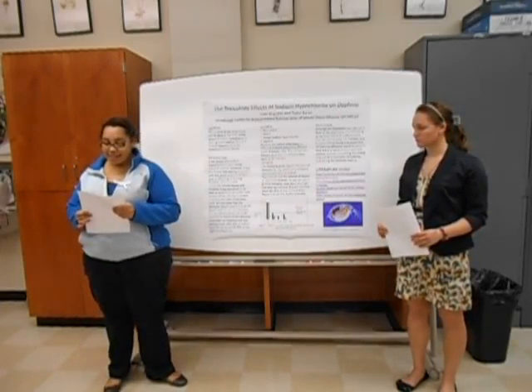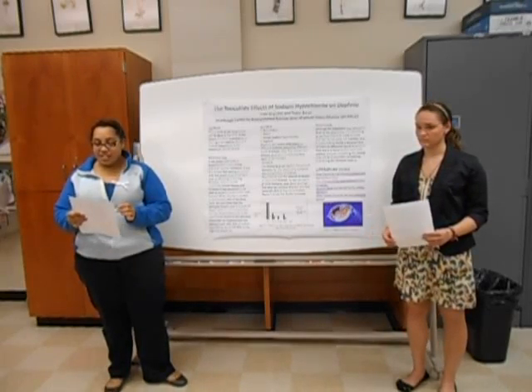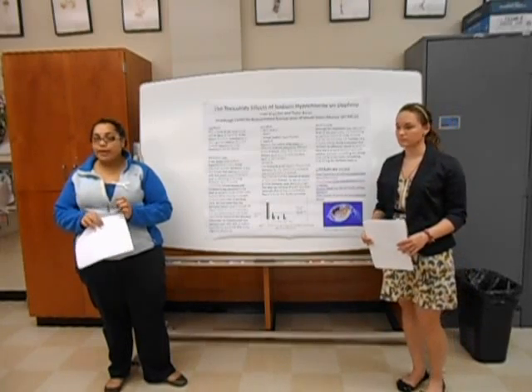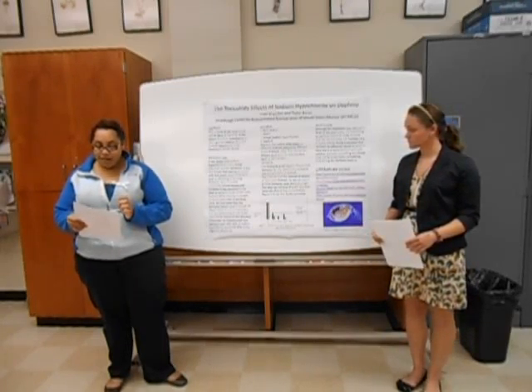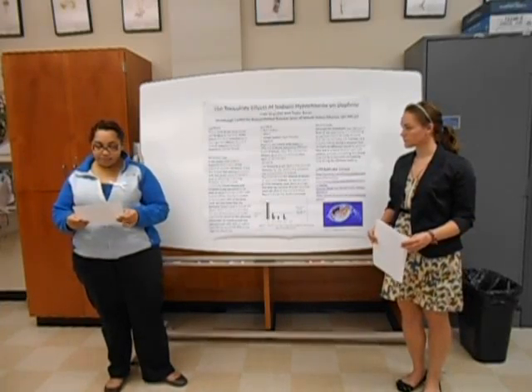Why did we conduct this experiment? We wanted to see how effective bleach is at removing bacteria, and we also wanted to identify at what point half of the organisms will die. We found deaths very high, even at very low concentrations.